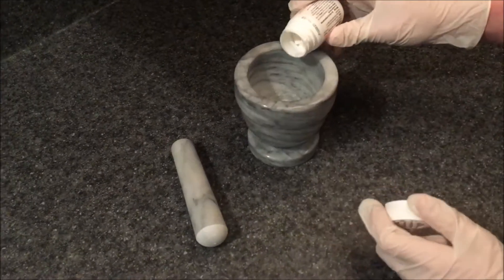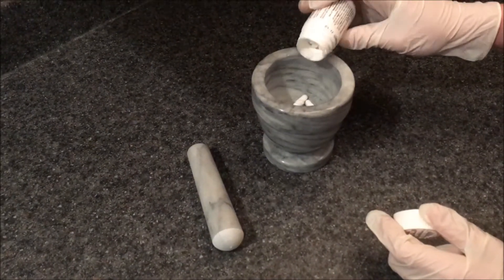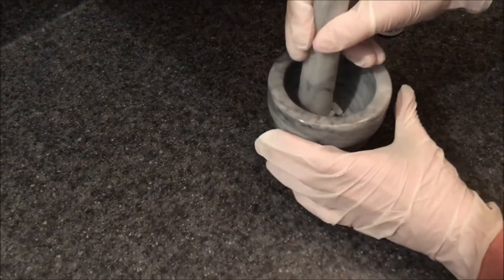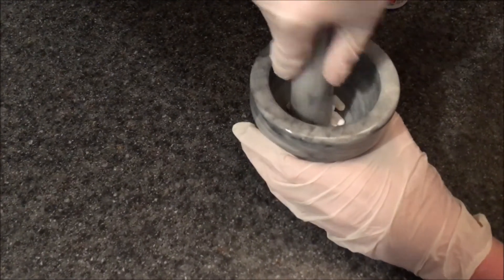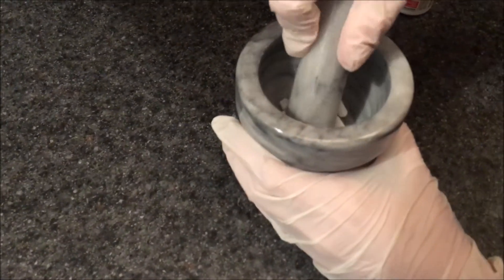The first step is to grind up your caffeine pills in either a mortar, pestle, or coffee grinder. The finer the powder, the better the extraction will go.